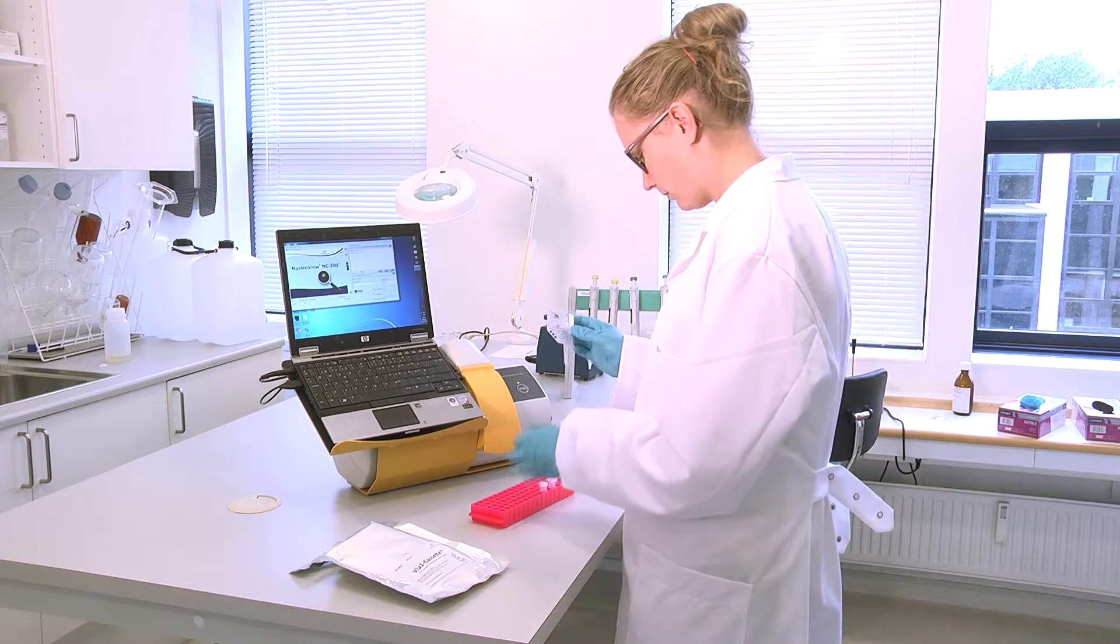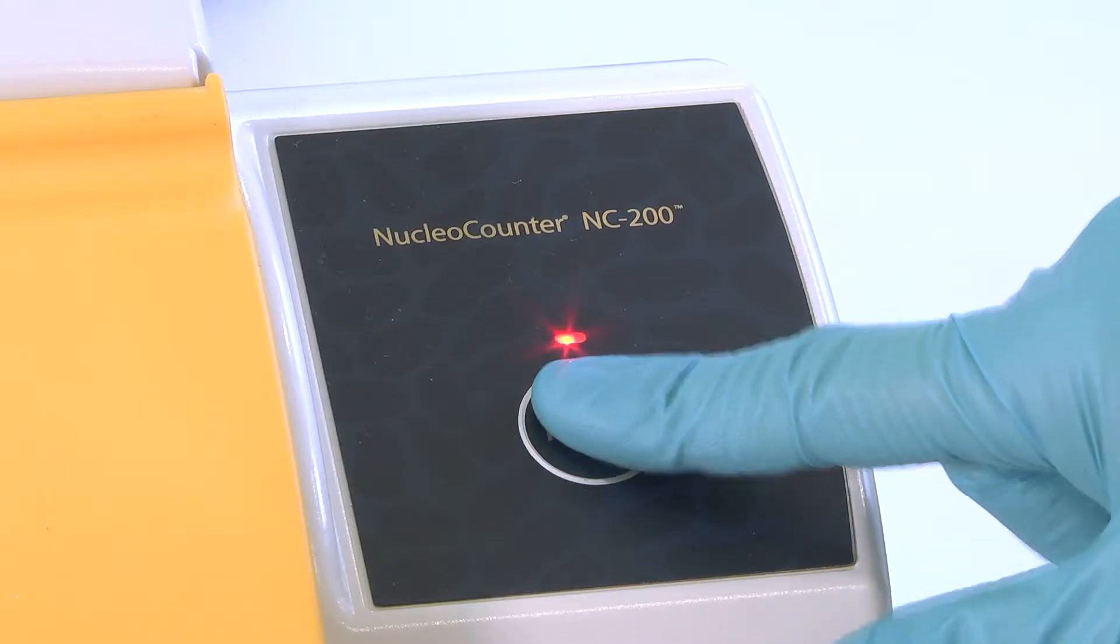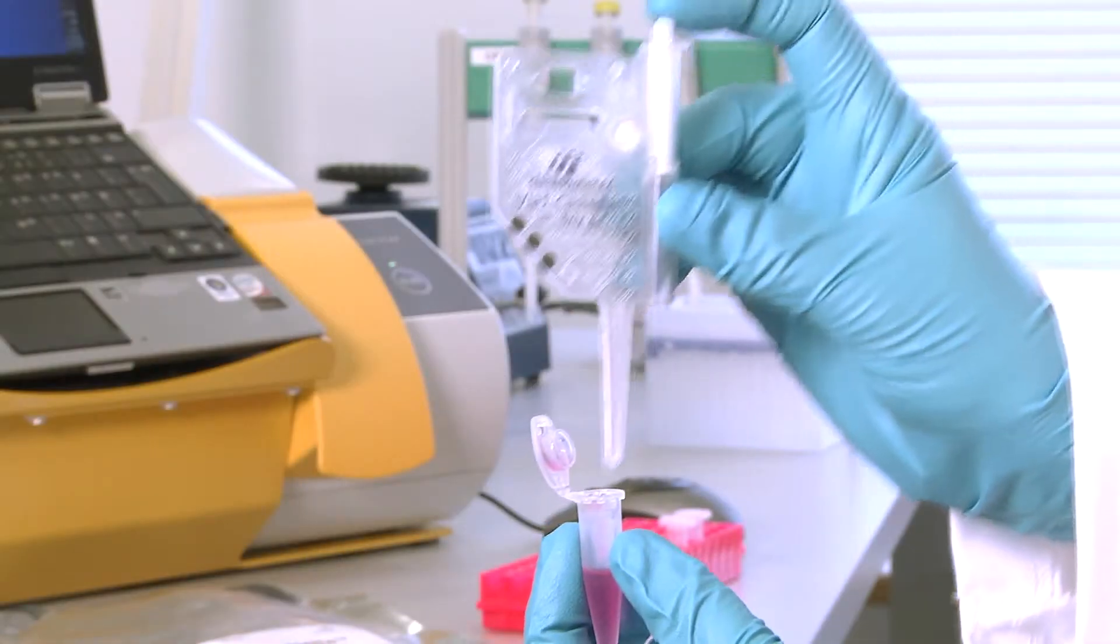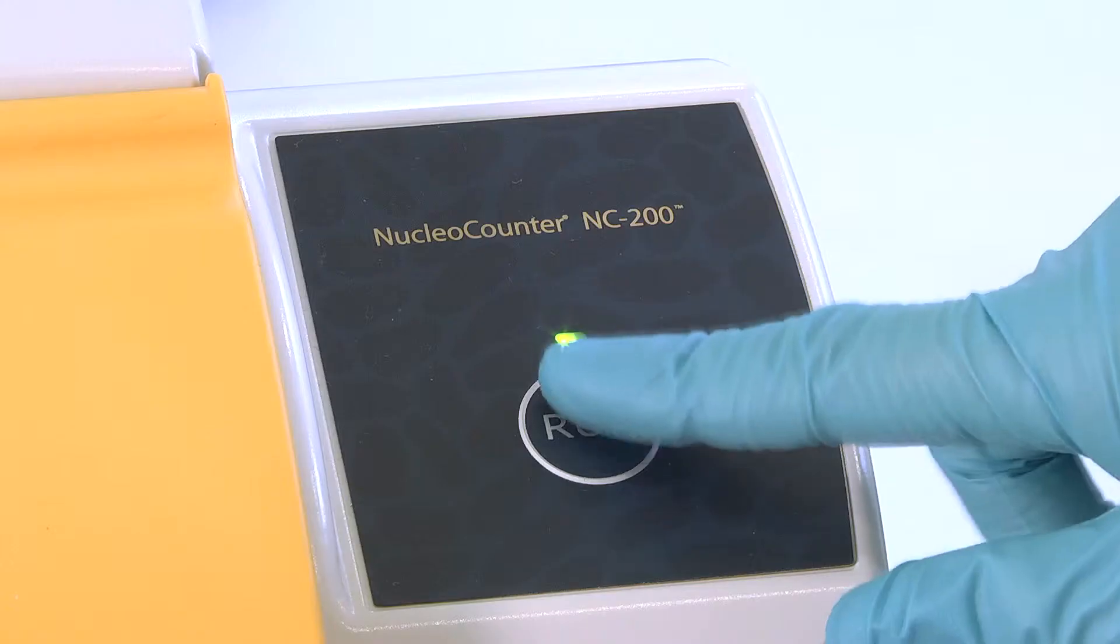First, insert a ViA1 cassette with a sample of cells mixed with the lysis buffer for the total cell count, followed by a ViA1 cassette with a sample of cells without the lysis buffer for the non-viable count.